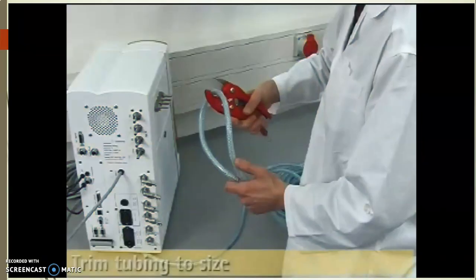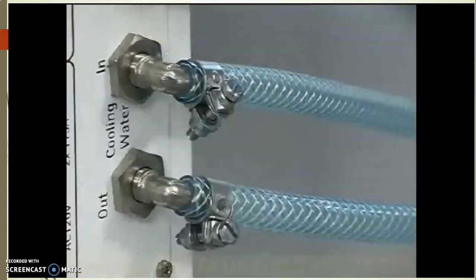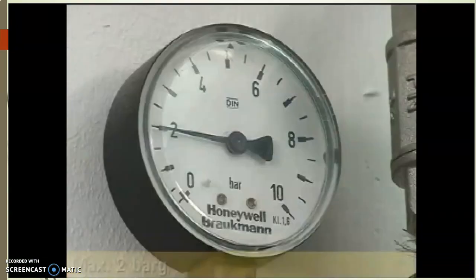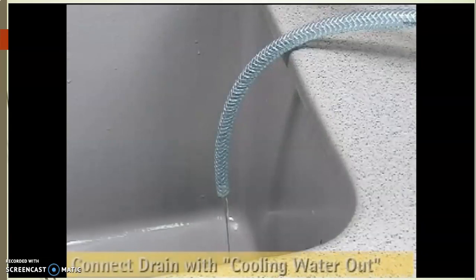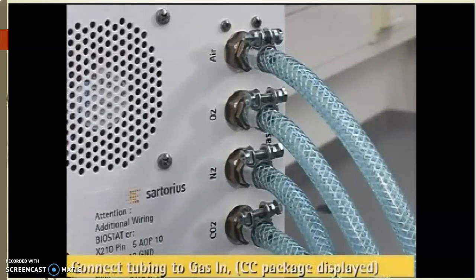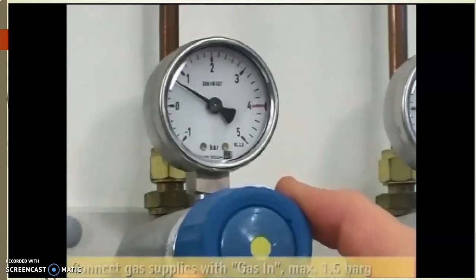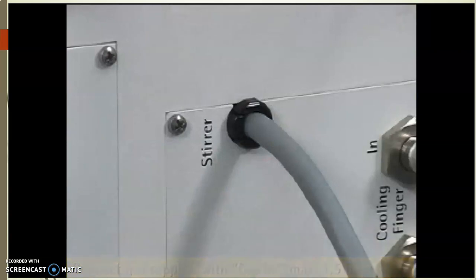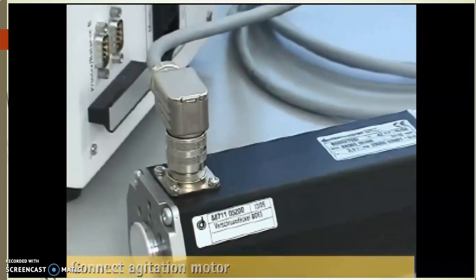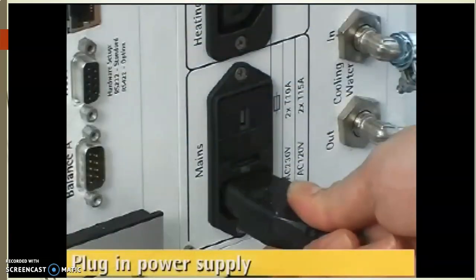This is the guidelines. Okay, we need to cut this, and then connect the tubings to the cool water and hot water, and also for the pressure and draining cooling water out at ambient pressure. So this is the diagram. You can see gas in, gas out, and then this is the agitation motor, and how to connect the agitation motor.